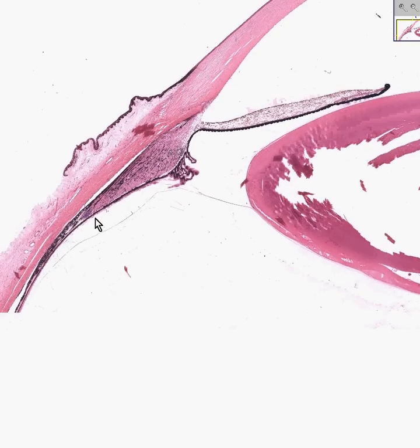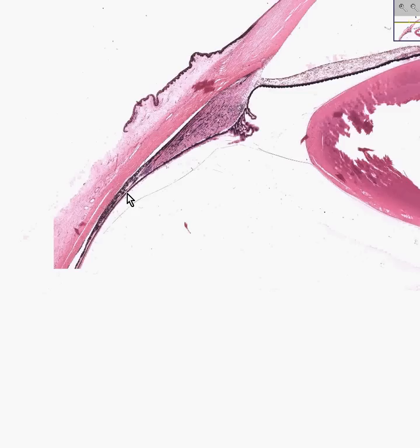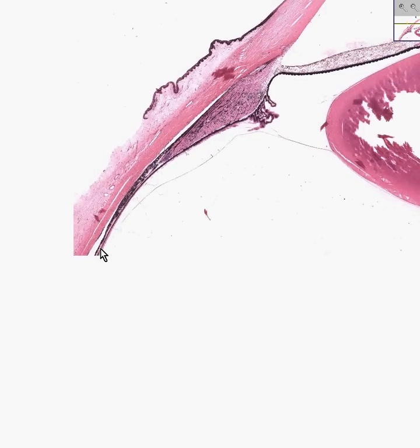The layer of the eye, which is not apparent in this specimen, but is almost about to be, is the neural tunic. And that's the tunic that is reserved for the retina. And the retina are your actual cells where light perception takes place, where you have photons of light that can ultimately convert into nerve impulses.